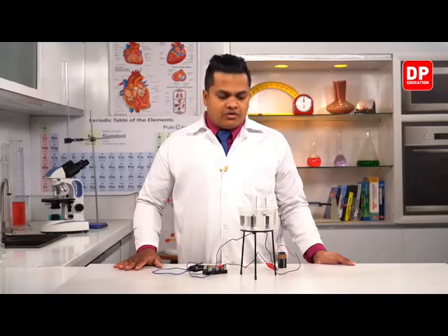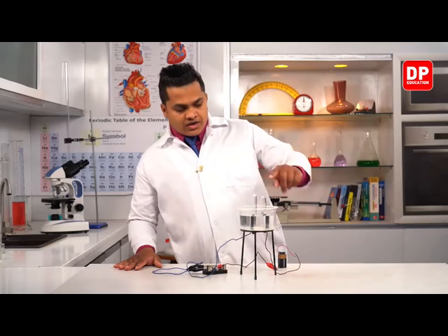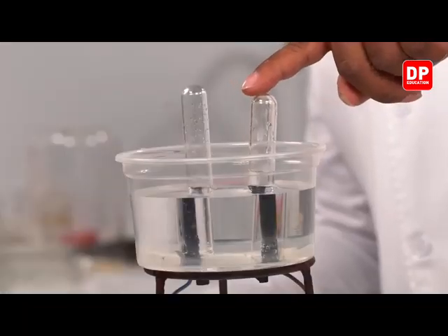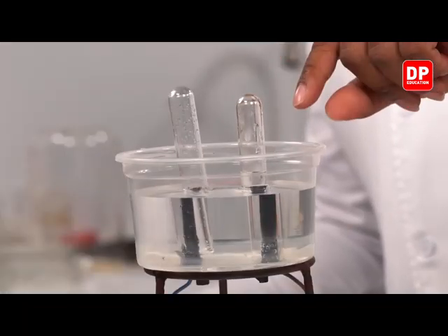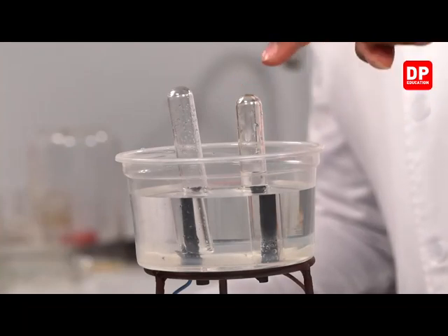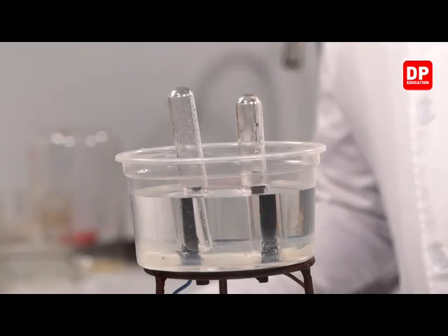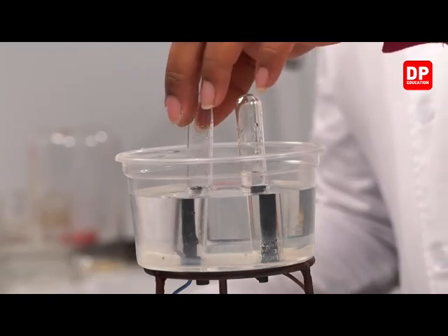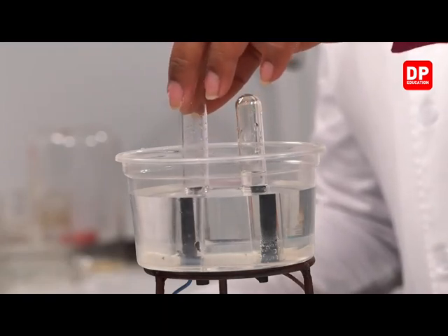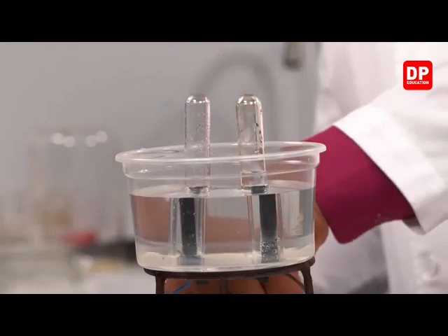So my dear children, now a certain volume of gases has been collected in both the test tubes. This is the positive terminal. There is a small bit of acidified water column left within the test tube of the positive terminal. However, a good gas amount, or good collection of gas, can be observed within the negative terminal over here.